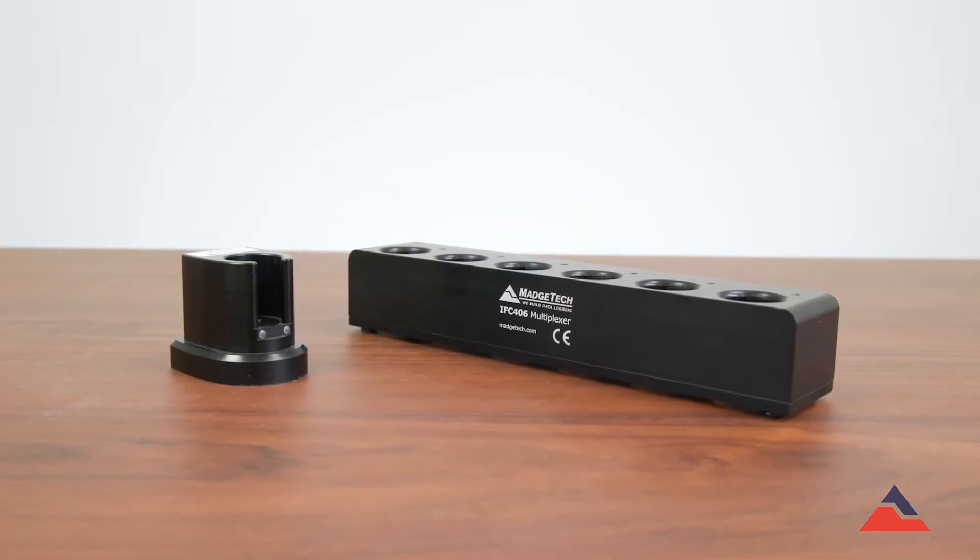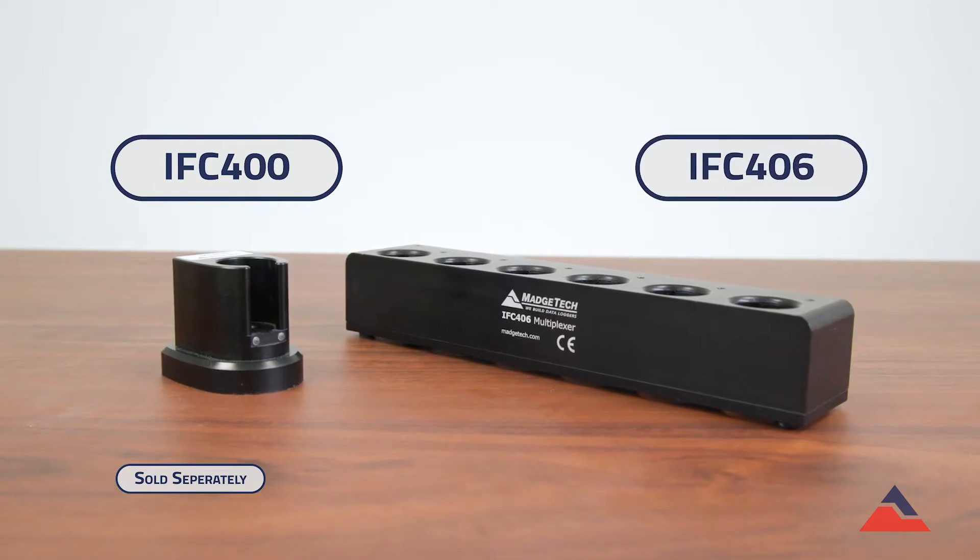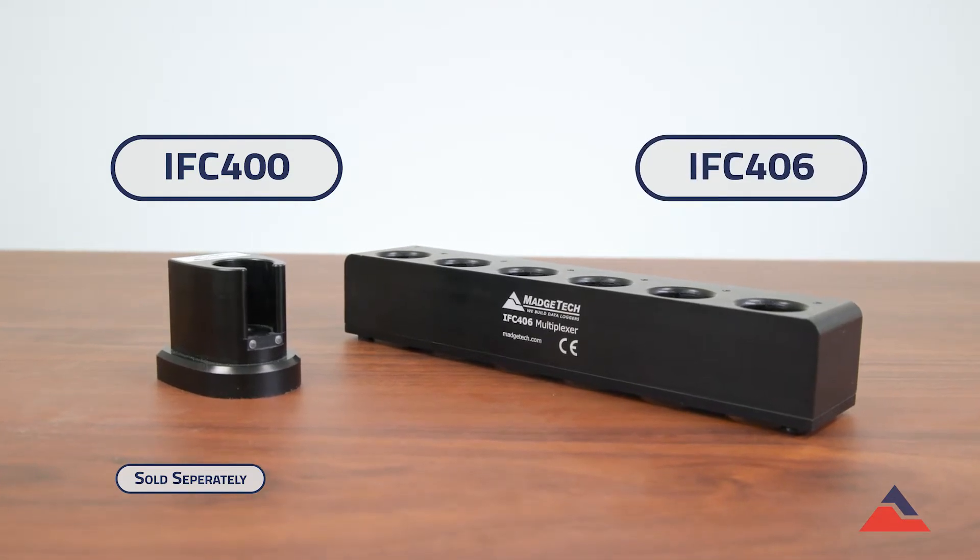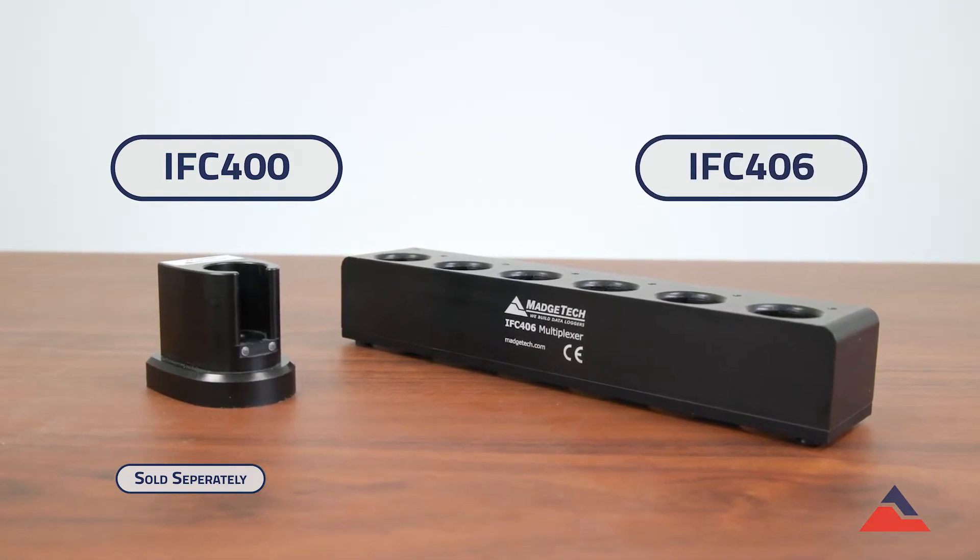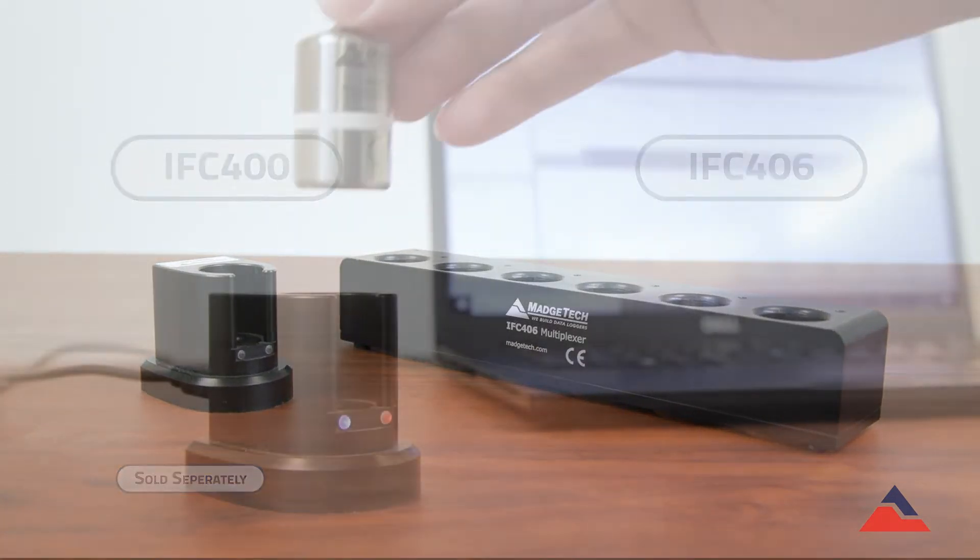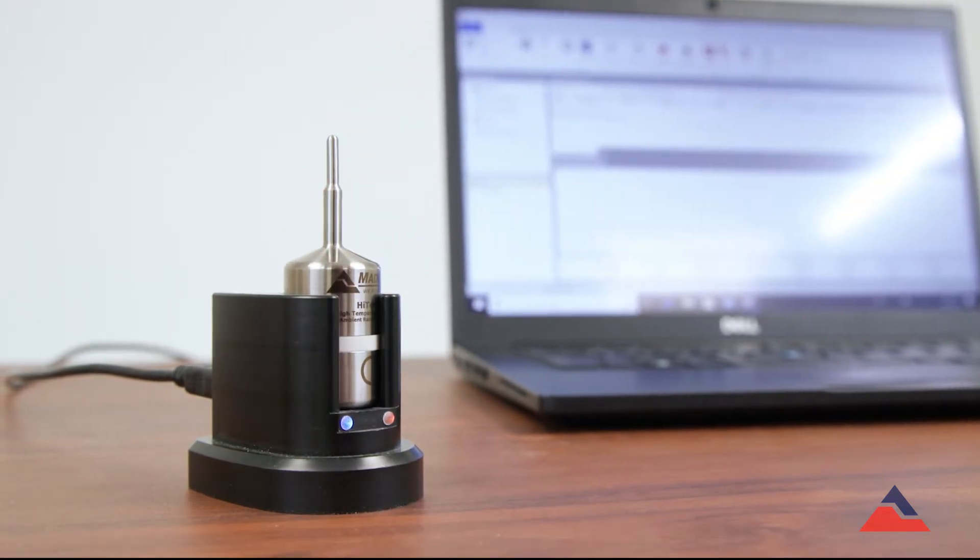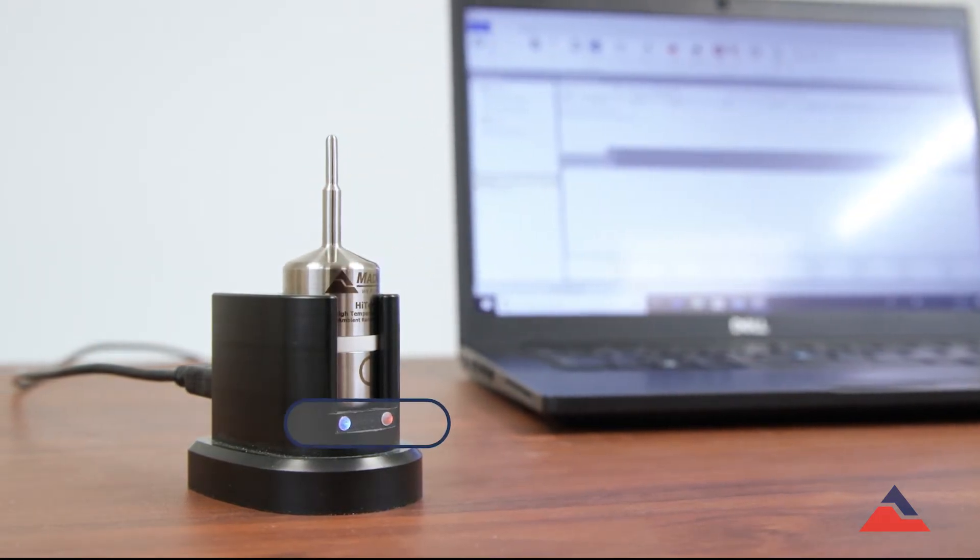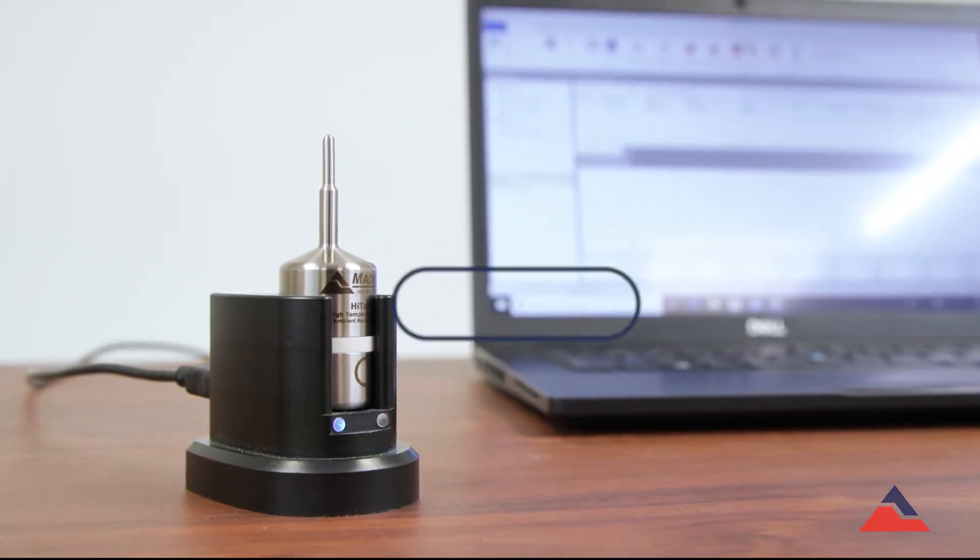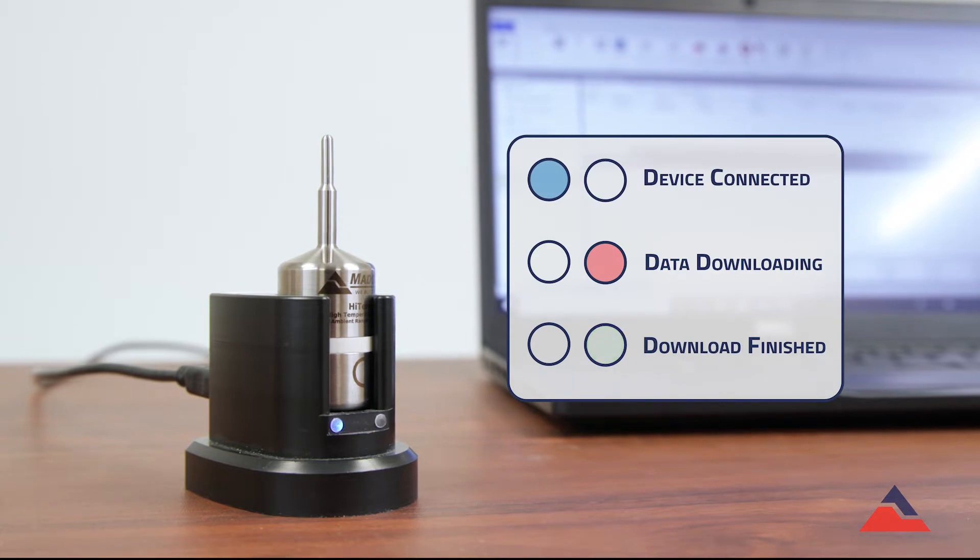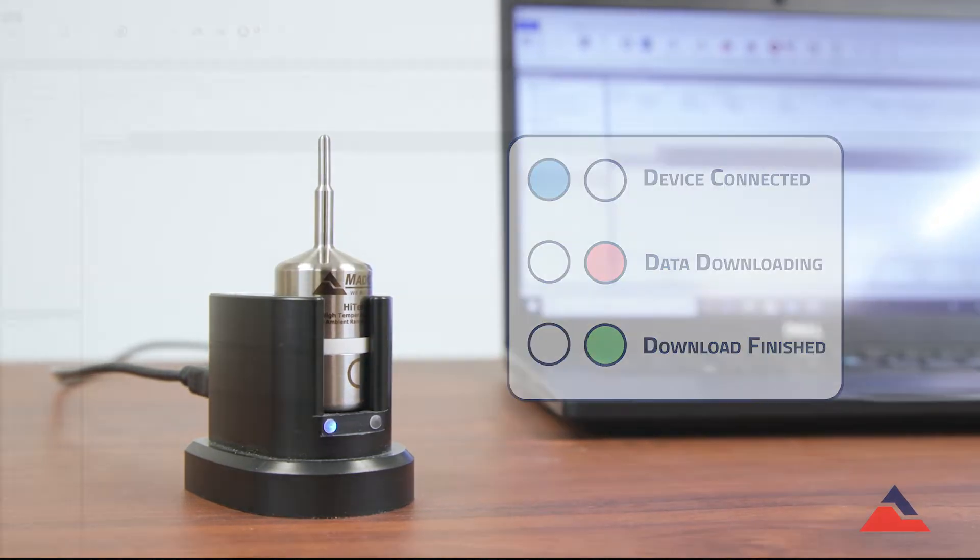Begin by connecting either the IFC400 or IFC406 docking station via its USB cable to the computer. Next, place the device in the docking station and check that the blue LED illuminates, confirming your connection. The color of the LED will change to indicate the current status of the connection.